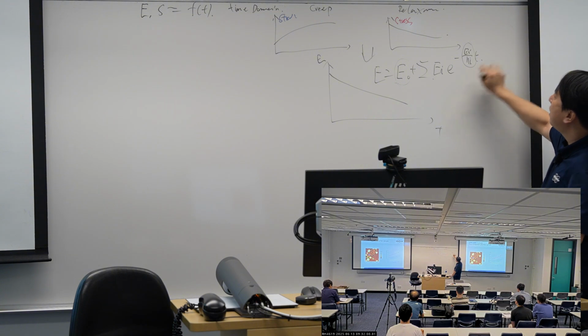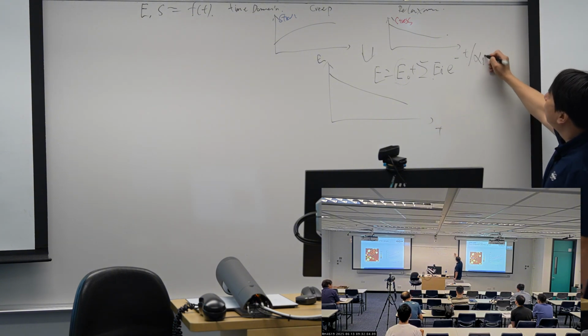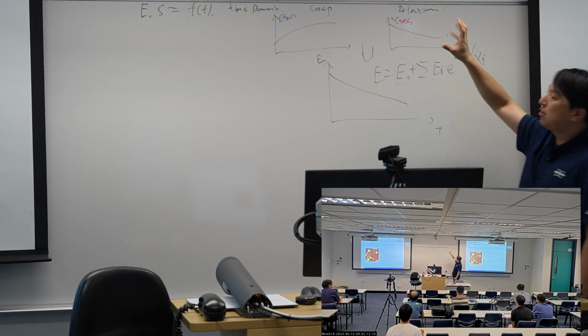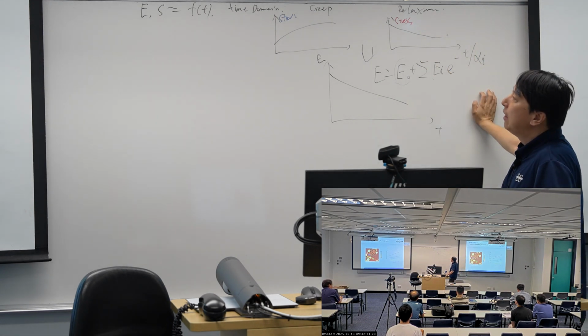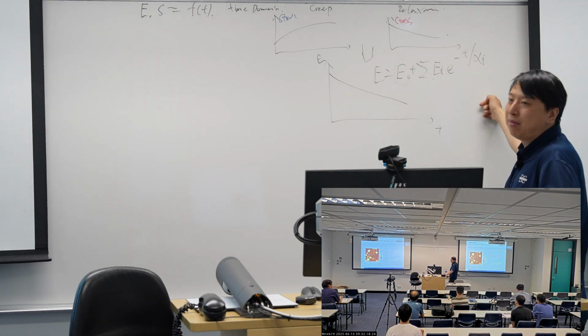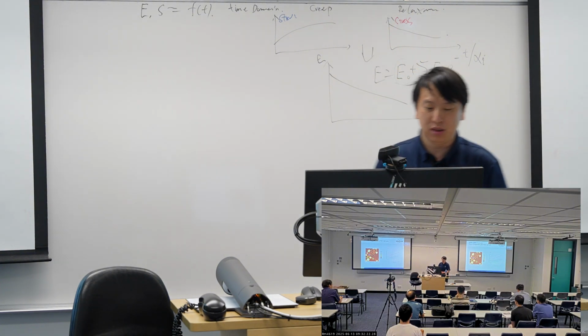Usually they represent this in a way of lifetime, but it's the same thing. So from the Maxwell model, people can tell what the viscous part and the elastic part distributed inside this material are.